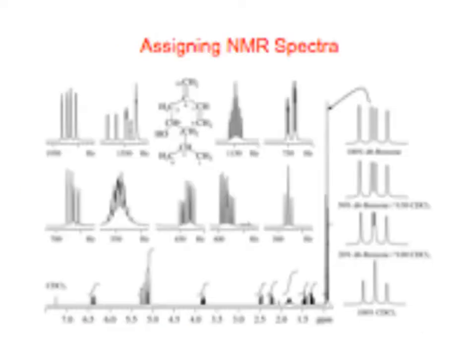All right, let's go now. Okay, so let's just look at a spectrum here. It has a structure there. Let's see if we can assign this. Lots of peaks, but look at how they're all pretty well resolved. So look at the structure, and the spectrum here is just solvent out here. If you look at that structure, which of the protons do you think would be the easiest to assign onto this spectrum down here?